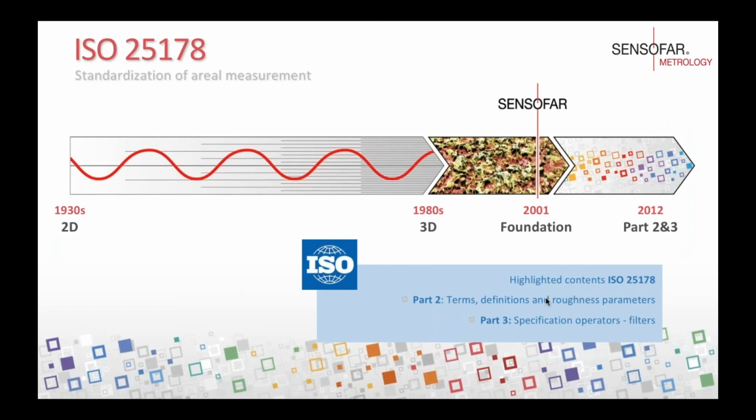And as time passed by, companies such as Sensofar were created. And in 2002, different entities, institutions, and companies related to optical metrology were reunited and tried to do a standardization of areal measurements, that is the ISO 25178. Sensofar is actually part of it, and this ISO has 7 different parts, but in this presentation we're going to go through part 2, which talks about roughness parameters, and part 3, which talks about filters.